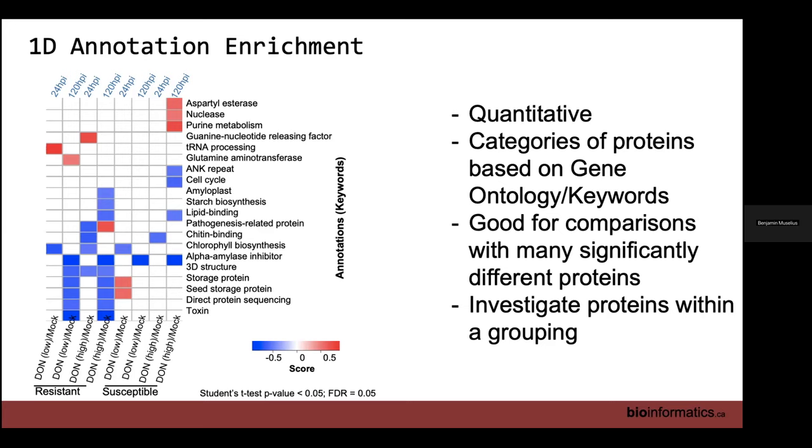There's great documentation. There's the Max Planck Summer School YouTube videos. There's a lot of power in what you can visualize using this. And if you want to take it to R and take those output files, that's excellent. That's what we want to see.